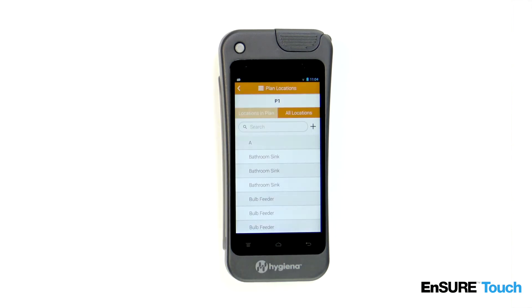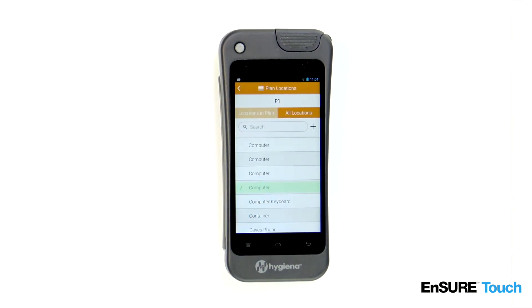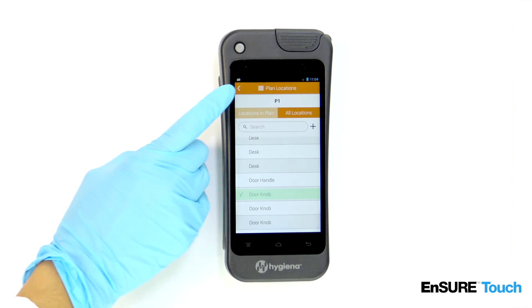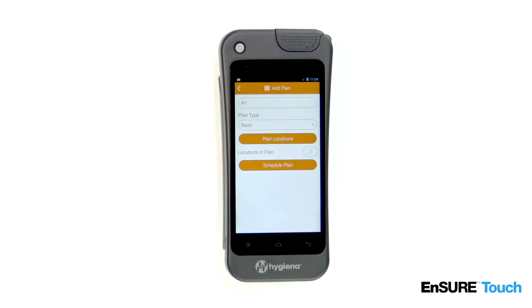Select the locations that you'd like to add to the plan. Touch the back button to automatically save your changes.